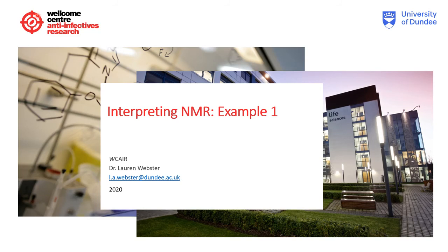So today I want to go through our NMR example, and here we've classified it as NMR1. Now before we continue, it is essential that you've already gone through and have an understanding of the 1D and 2D NMR lectures that are represented on CAIR's website.